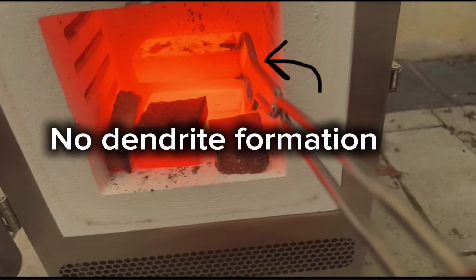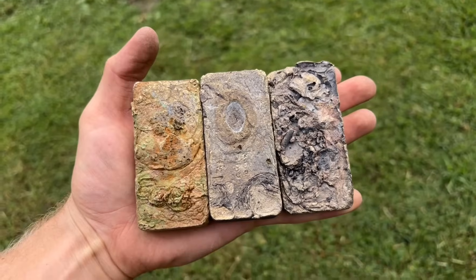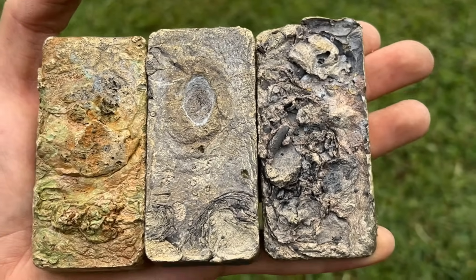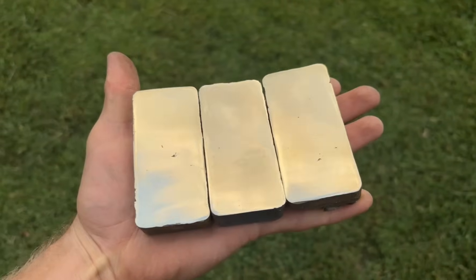All that's occurring in the ingot now is rapid grain growth and diffusion. So I pulled one of the ingots out of the furnace and allowed it to air-cool, while the other ingot remained inside the furnace and was allowed to cool slowly. After I had all of my ingots cooled, I was ready to grind and polish them, leaving me with three shiny ingots. And at this point, it was time to etch them.